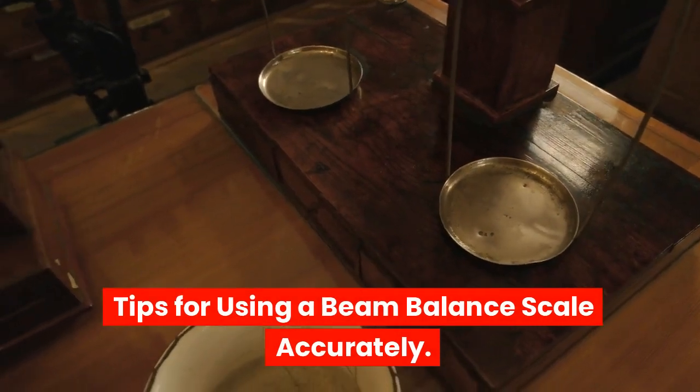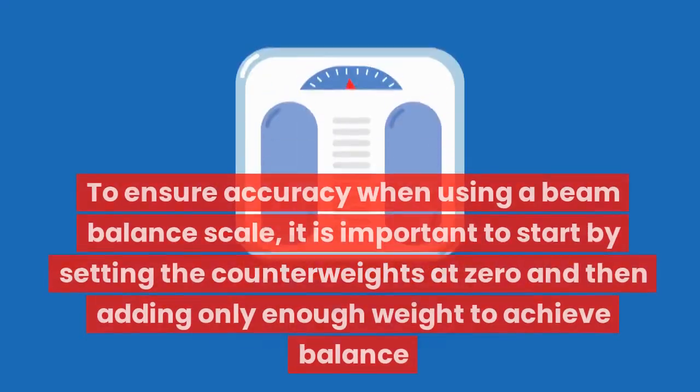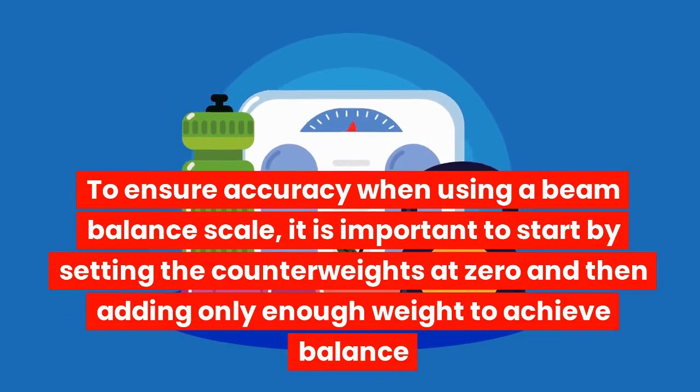Tips for using a beam balance scale accurately. To ensure accuracy when using a beam balance scale, it is important to start by setting the counterweights at zero and then adding only enough weight to achieve balance.